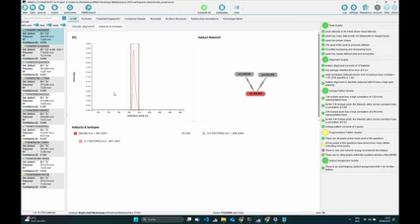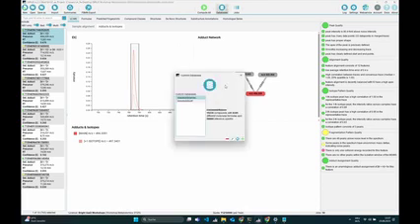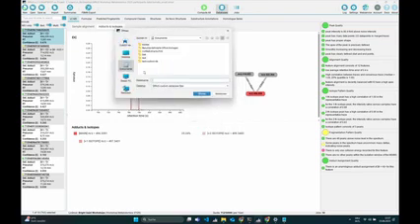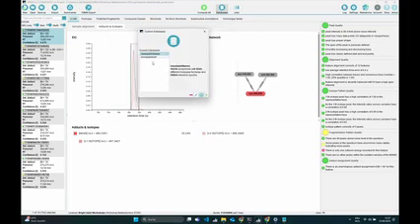And I do it through the import button, right? Yeah, the import is here. There are two options. Either you are opening an existing database, which is basically just adding it to the software so that it knows where it is.